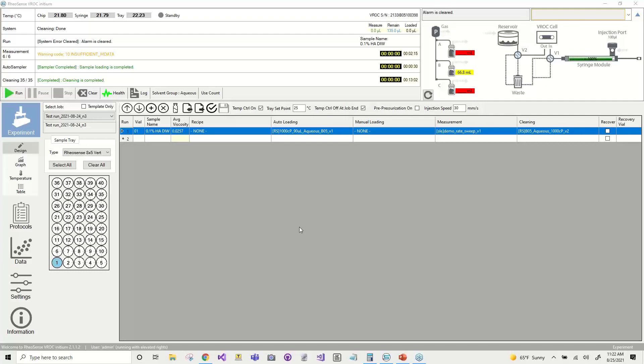I want to talk a little about sample retrieval and why that's advantageous. The Initium has an option where, after each segment during a measurement takes a specific amount of volume — let's say 10 microliters — the Initium syringe is only 100 microliters, but retrieval essentially allows you, after you've exhausted the amount of volume loaded, to run the system in reverse and pull your sample back into the test range so it's available to test again. You can essentially get unlimited measurements out of a fixed amount of sample volume. The cleaning protocol is the last protocol you'll need to select — it's chip and solvent group specific. The software makes it fairly simple in terms of which loading and cleaning protocols you'll need to select.